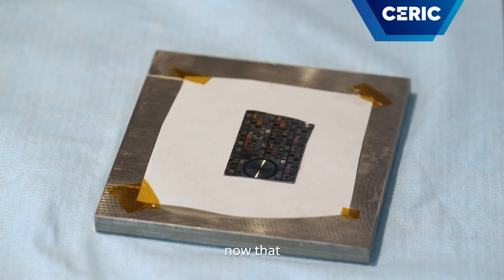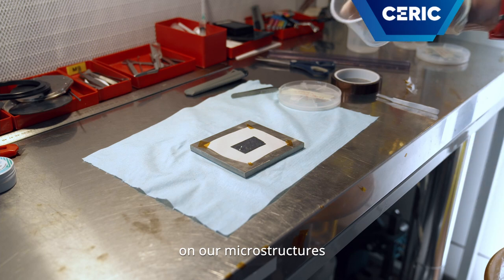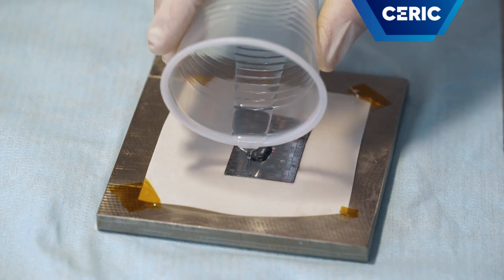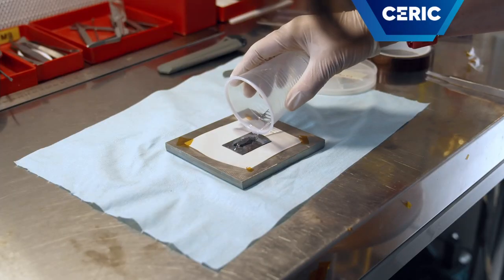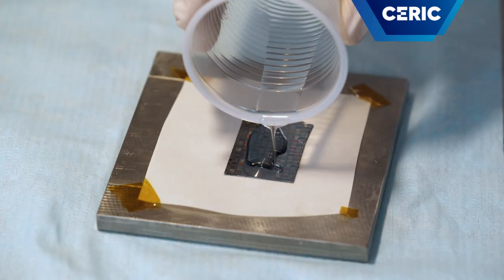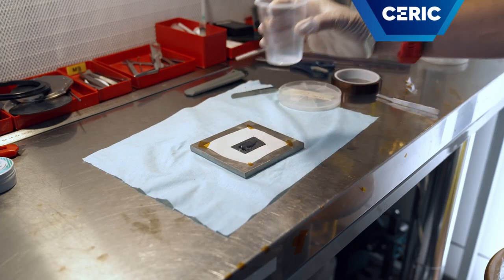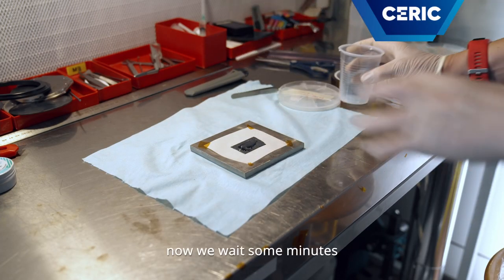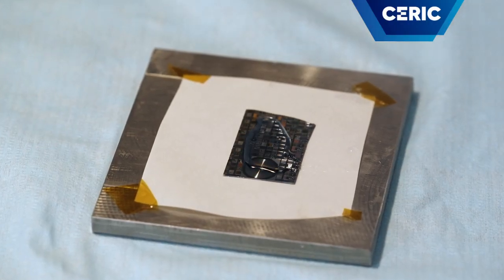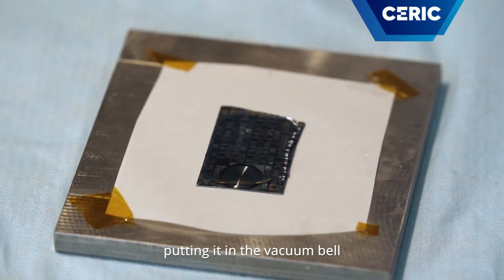Now that we have removed the bubbles, we pour the PDMS on our microstructures. Now we wait some minutes for it to spread over all the surface. Now we can degas again by putting it back in the vacuum bell.